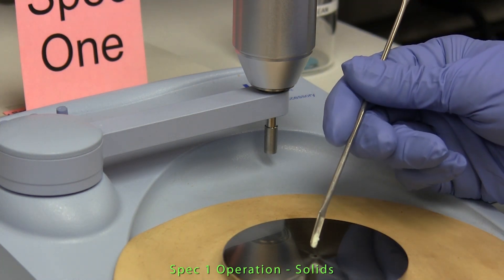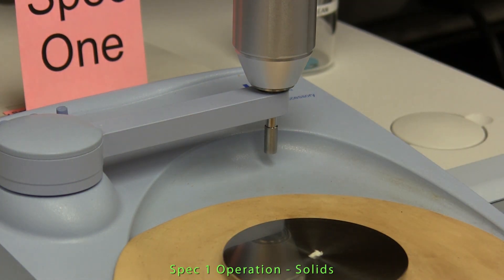Using a spatula, a small amount of the solid sample is added to the mounting plate so as to cover the exposed surface of the crystal.